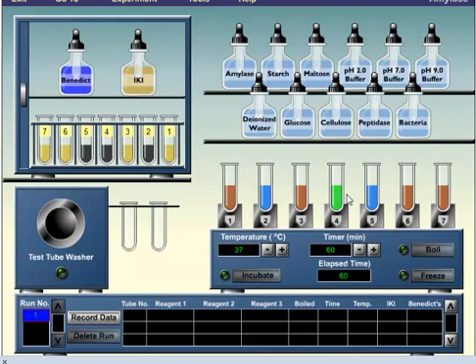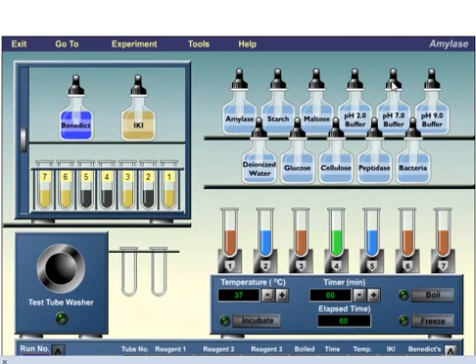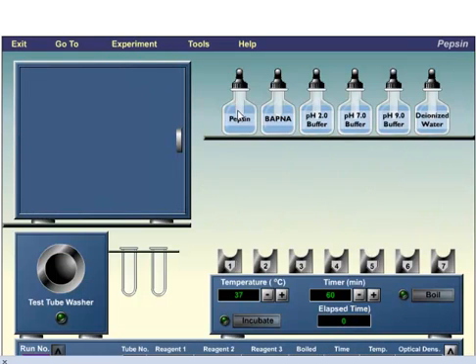All this instruction is in your lab manual, in the instruction I sent you. That instruction tells you about those color changes and what each means. When I'm done with this lab, I will do it with pH number seven. I'll just use any of those solutions and then I could go to the next experiment.